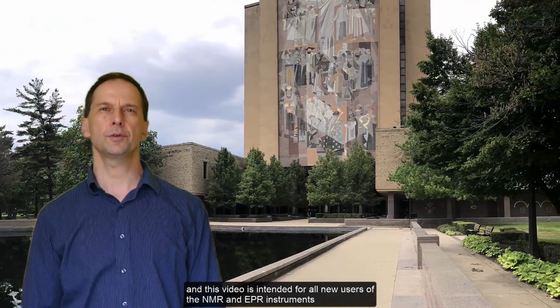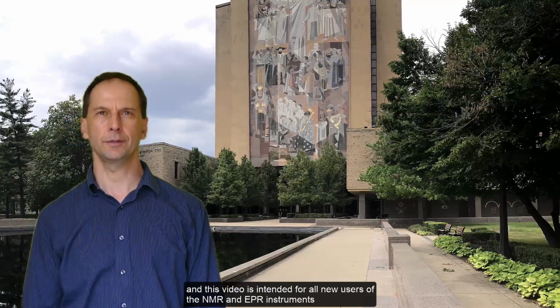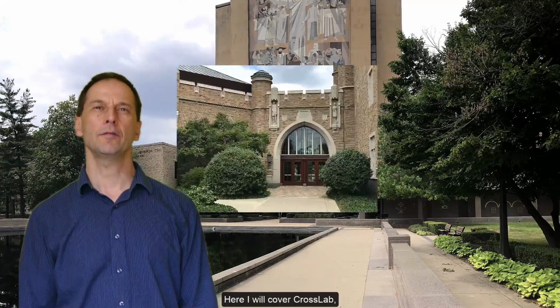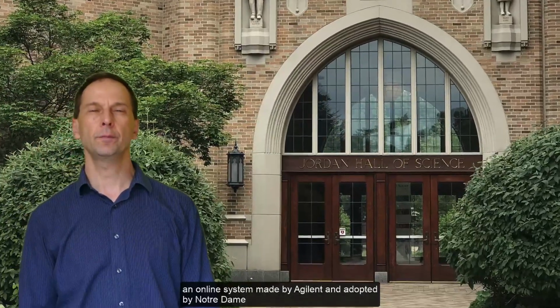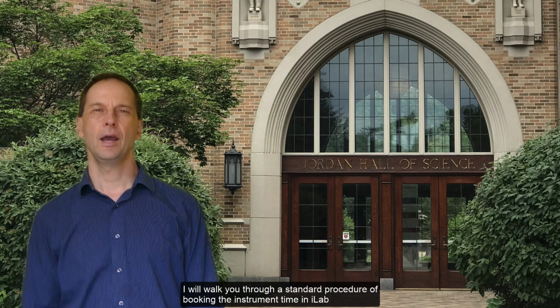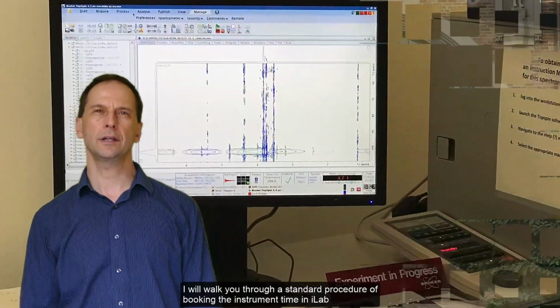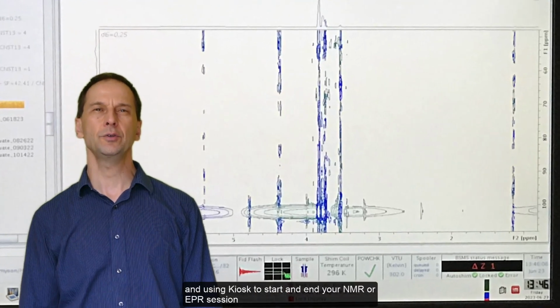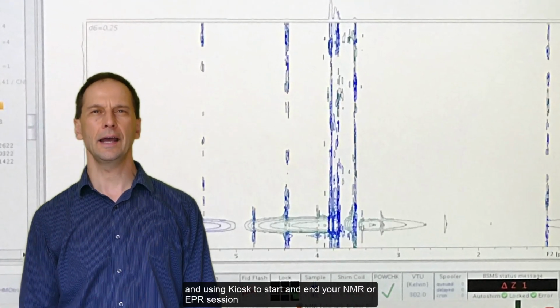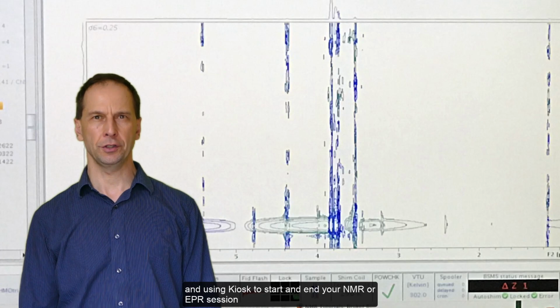I am Evgenii Kovrigin, your NMR director, and this video is intended for all new users of NMR and EPR instruments. Here, I will cover CrossLab, an online system developed by Agilent and adopted by Notre Dame for all instrument centers on campus. I will walk you through a standard procedure of booking instrument time in iLab and using Kiosk to start and end your instrument session.